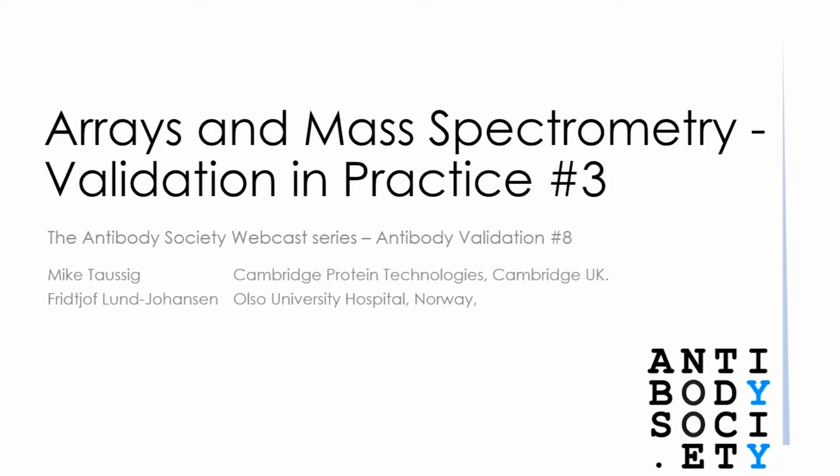Great, thank you. So if you want a full definition of what an antibody can bind to, immunoprecipitation-mass spectrometry is hard to beat. But of course, it can't deal with the various other experimental contexts that we've discussed in the series, like immunohistochemistry or Western blot, for example, because it's only applicable for antibody binding in solution.